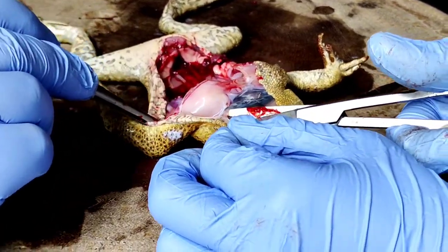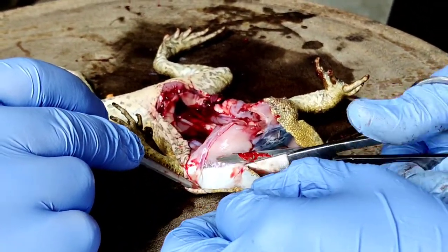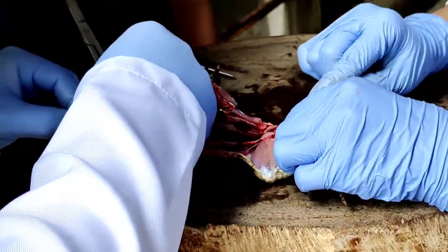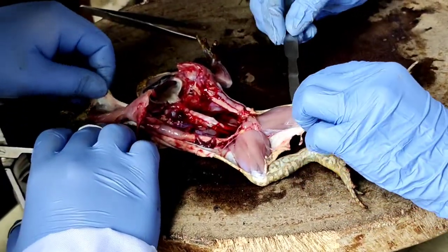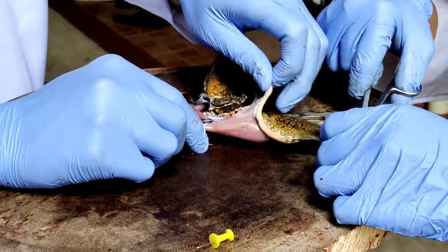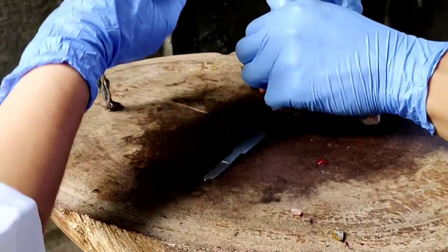The final organ which was extracted was the skin. It was the toughest organ to extract, since it is the largest organ and it was still attached to all the muscle tissue. We also removed as much muscle tissue as we could from the bones so that the rest would be easier to scrape off during the preservation process.